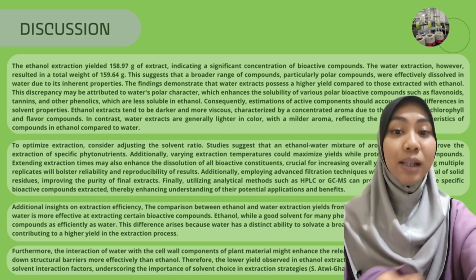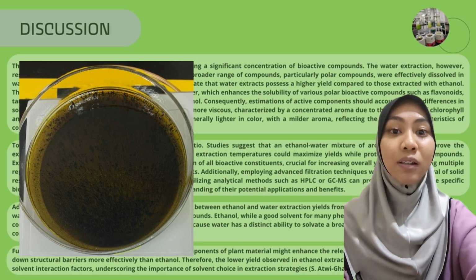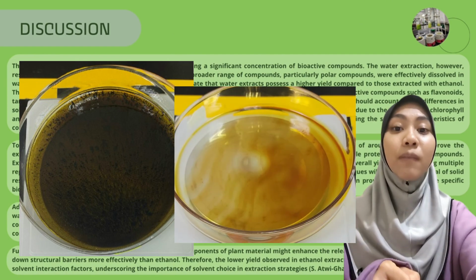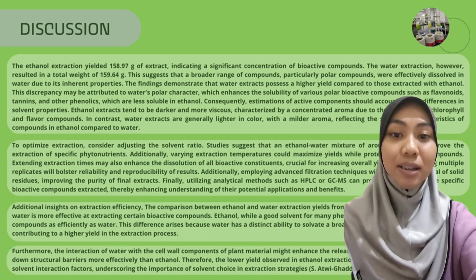In terms of color, texture, and odor, ethanol extract tends to be darker and more viscous, characterized by a concentrated aroma due to the extraction of chlorophyll and flavor compounds. In contrast, water extracts are generally lighter in color, with a milder aroma reflecting the solubility characteristics of compounds in ethanol compared to water. To optimize extraction, consider adjusting the solvent ratio.